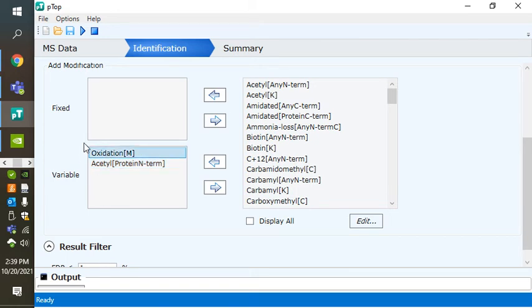And also, I would note that it's really kind of zany to assume that all proteoforms will lack any methionine oxidation. If you think about it, if you have even 4 methionines on a proteoform, and each of them has a 1 in 5 chance of being modified, the chance that all 4 are not modified is, sorry, I gotta think about this, is 80% for each one raised to the 4th power. So that's 0.64 times 0.64. It's not a high number. You want to retain sensitivity for proteoforms where even one of the methionines has become oxidized. So it's very important to include oxidation on this list.